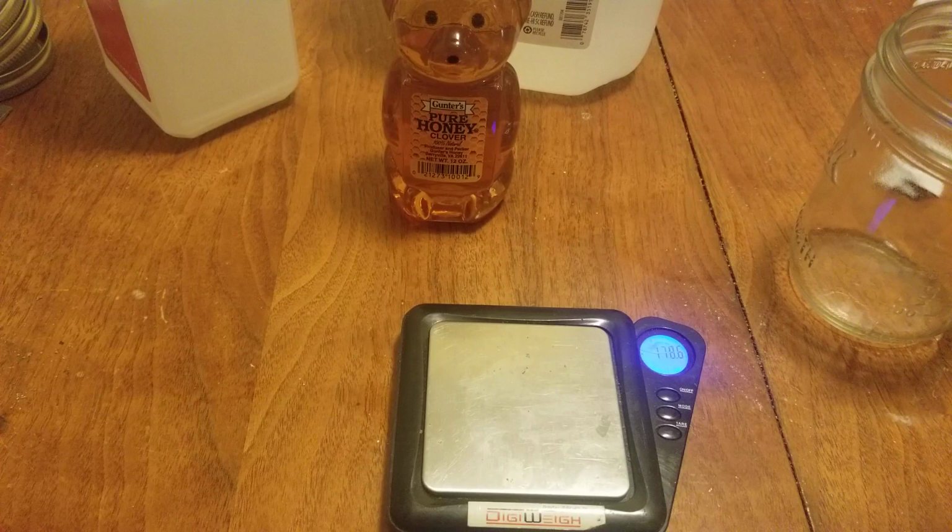But yeah, like I was saying about that 10% threshold. If you go over 10%, like say you use more than 10% of 6 grams, then they will not germinate. And it works the same way at the other end. If you're 10% lower, then obviously it won't have enough food to feed on.